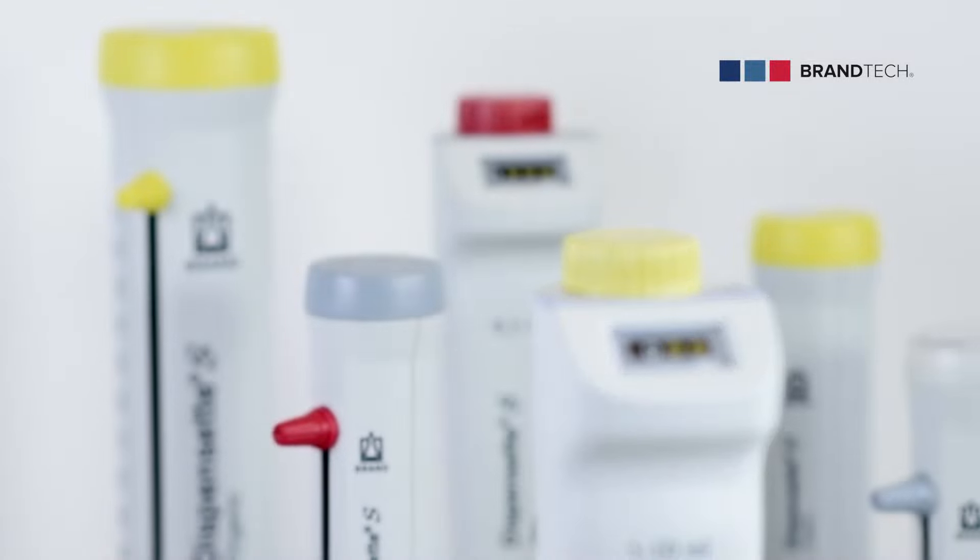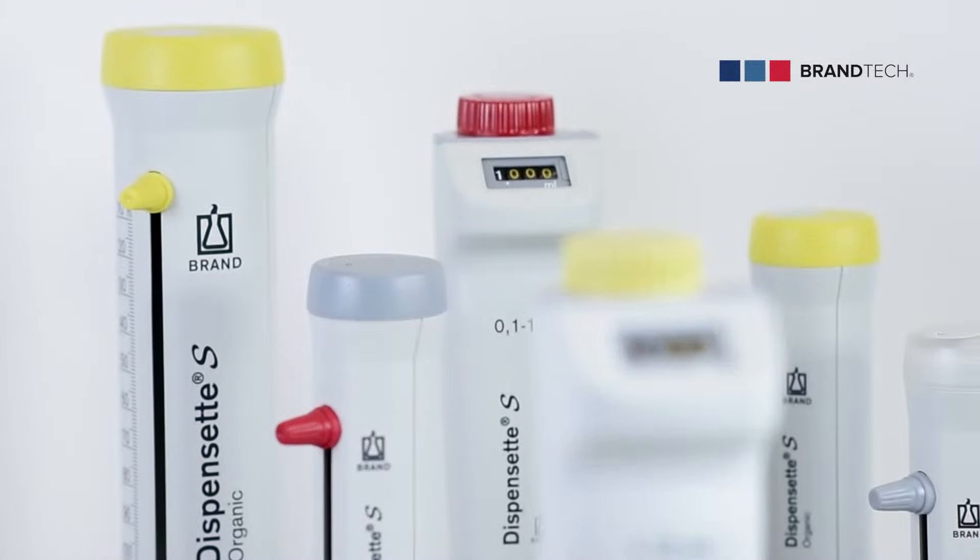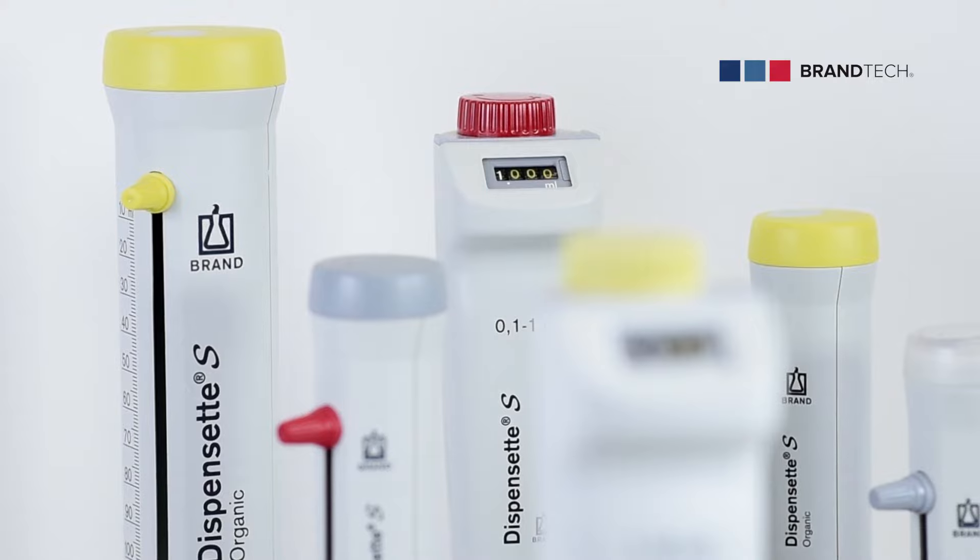Care and use of your Dispenset S Bottle Top Dispenser. This video highlights the proper use and care of the Dispenset S and Dispenset S Organic.